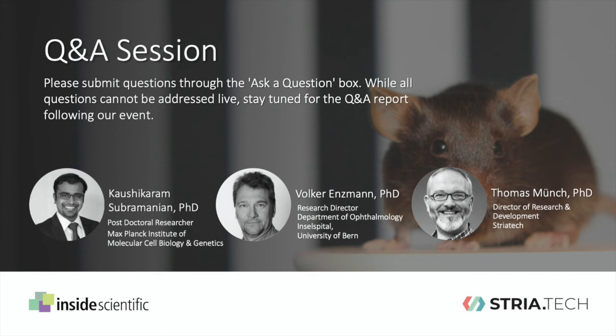Yes, in principle they can, but there are some exceptions. For example, the mouse line DBA2J, that is a model to study glaucoma. For that mouse line, some studies find that these mice simply do not have an optomotor reflex, independent of their retinal phenotype.